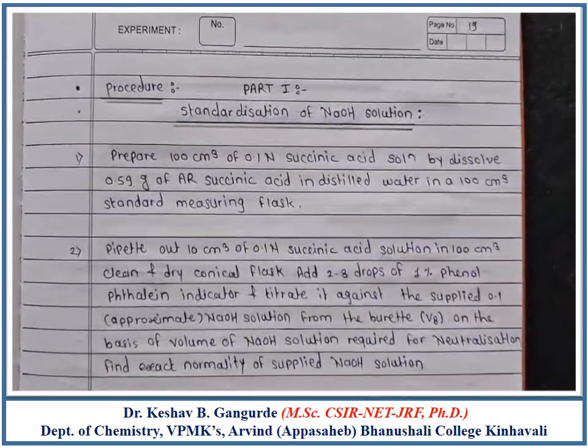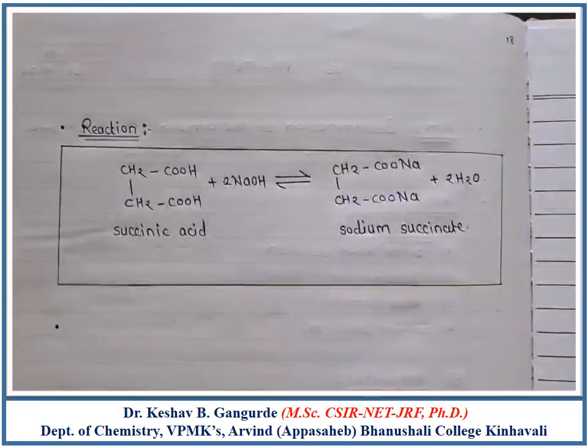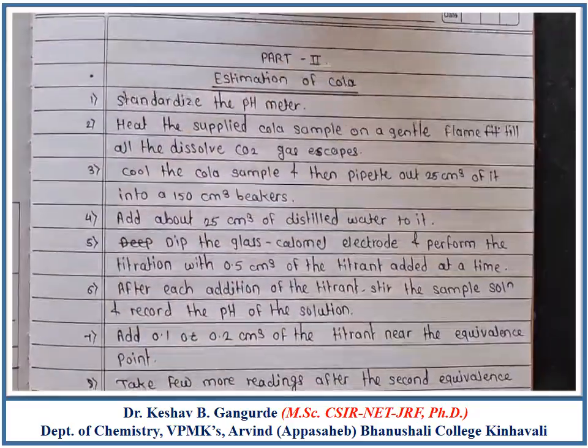There are two parts of this experiment. In the first part, we will perform standardization of NaOH solution, and in the second part, we will do the estimation of Coca Cola sample.